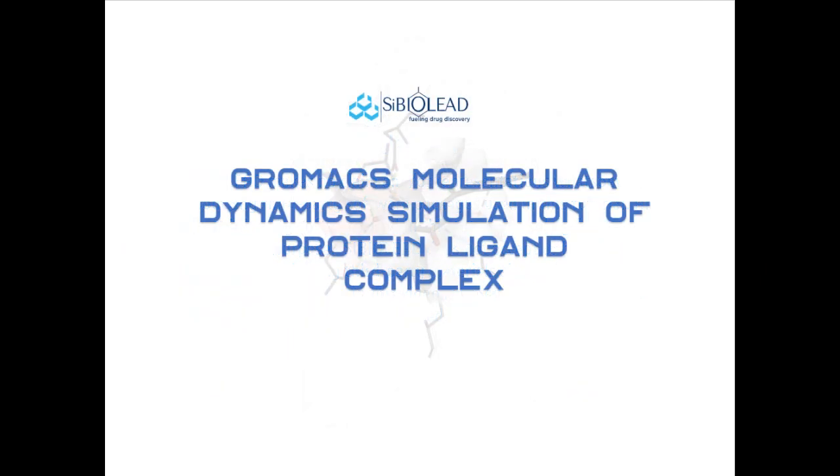In this tutorial, we are going to see how to set up a GROMACS simulation of protein bound with ligands using SI-BioLead's MD simulation module.